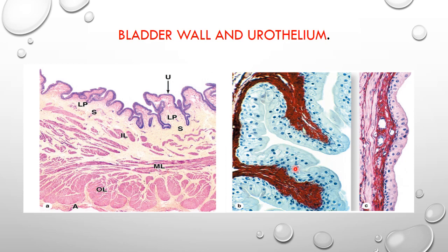This is showing you the contracted state of the urinary bladder, in which you can clearly see the dome-shaped cells of the transitional epithelium. This is a special stain, and when the bladder is full, you can see that these dome-shaped cells become flattened, and the layers appear as 2 to 3 layers, whereas in the empty bladder, they appear as 4 to 6 layers, and the surface cells become flattened in a distended bladder.